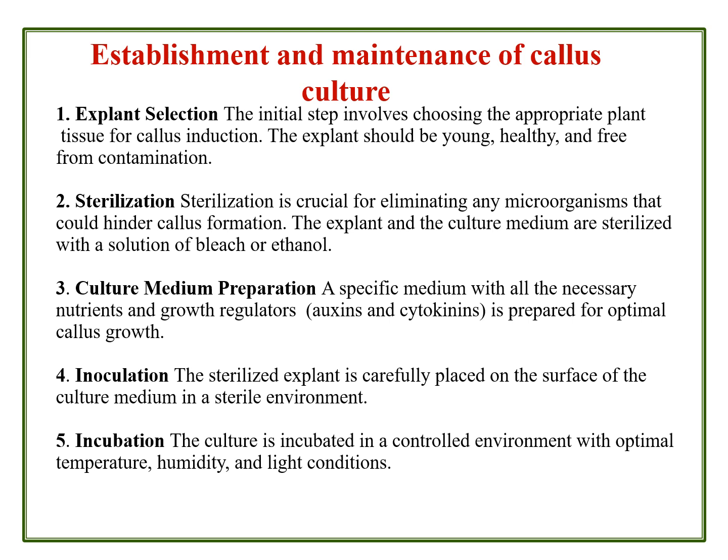Here UV rays can directly affect the thymidine molecules of the DNA of the microbial forms.